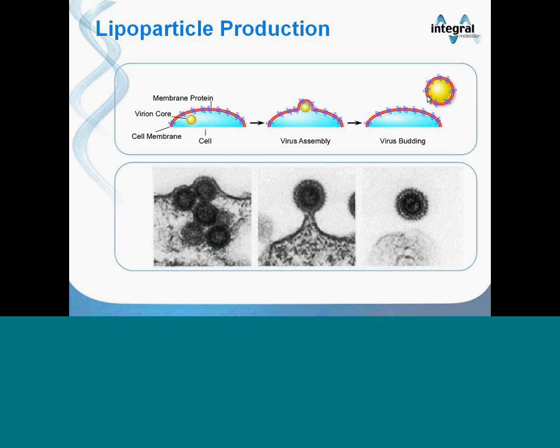We don't usually see that. If you have BSA in your running buffer, you really shouldn't be seeing any non-specific binding. Okay, so the amount of BSA, and you said you use a little bit of BSA. How much is that approximately per liter of buffer? 1 mg per mL is typical, but you can use higher. Okay, 1 mg per mL, and you can use higher. Right. Okay, thanks. You're welcome.